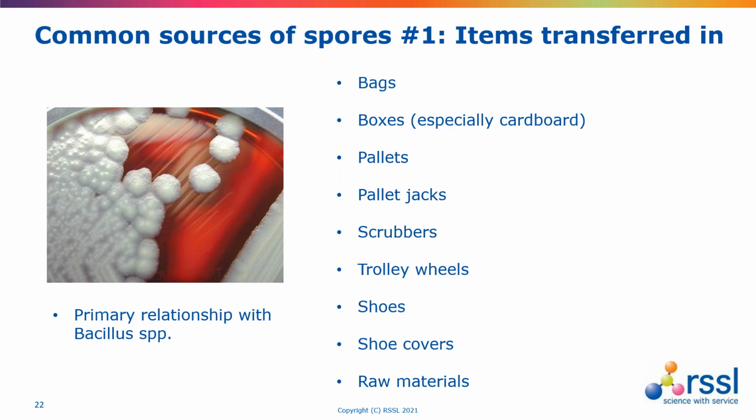So certain bags have been associated with spores. It's well known that cardboard and paperboard are rife with spores. So that is one of the reasons why cardboard should never enter a clean room. There should always be a sufficient layer of wrappings to enable items to be transferred through various steps, and certainly this outer kind of material shouldn't be going anywhere near the clean room. Pallets and floor scrubbers have come up fairly high.